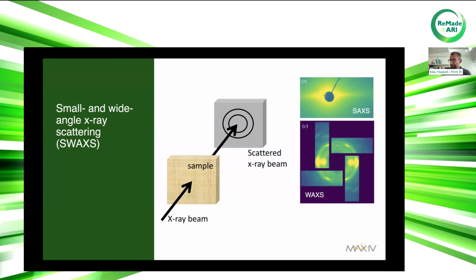That's small angle scattering, in this case of optical light from fairly large water droplets. Now, if we go to X-rays instead, we see the same phenomenon. The difference is that now the scattering depends on the nanoscale density variations of the material that is scattering the X-rays. So that gives us a means for probing the nanoscale structure in these materials.